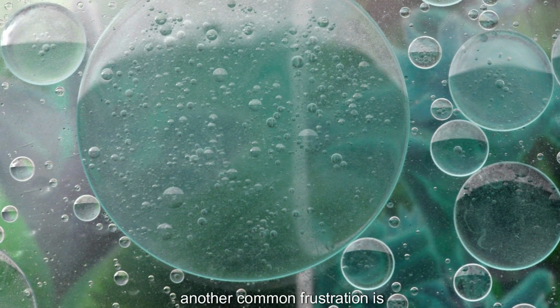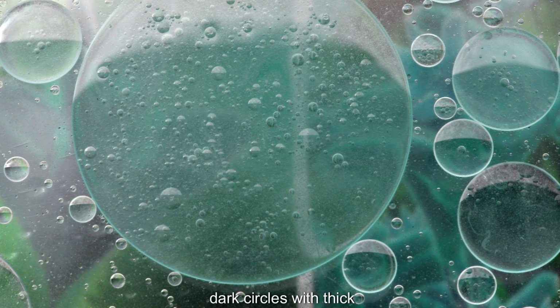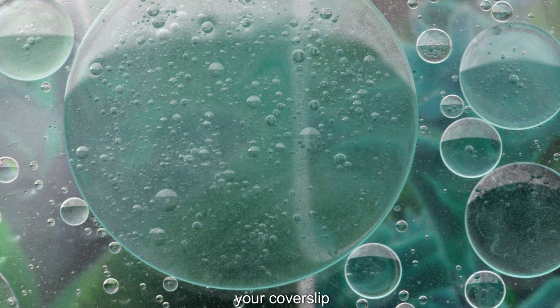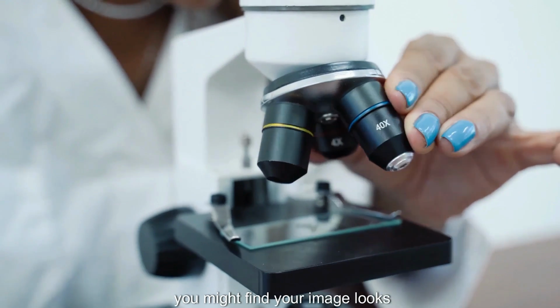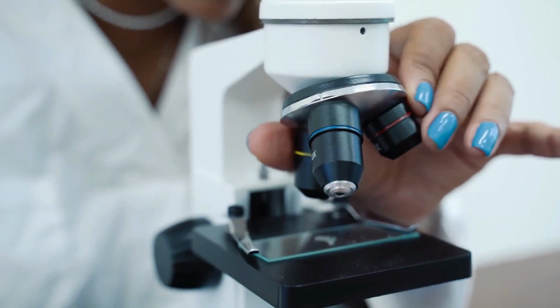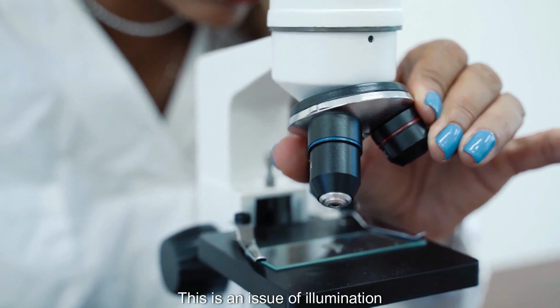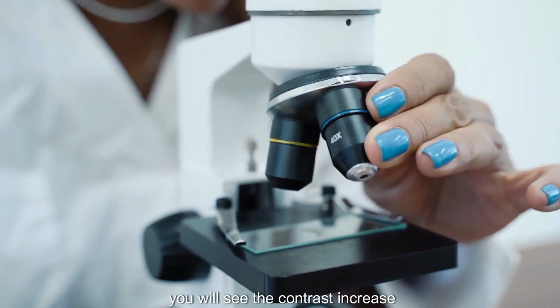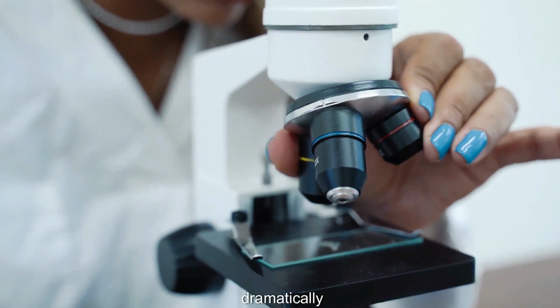Another common frustration is encountering large dark circles with thick black rings. They are air bubbles trapped under your cover slip. Finally, you might find your image looks washed out. This is an issue of illumination. Slowly close the diaphragm. As you do, you will see the contrast increase dramatically.